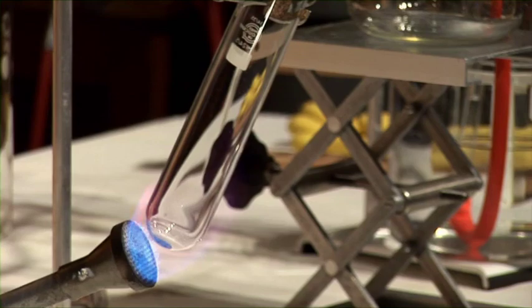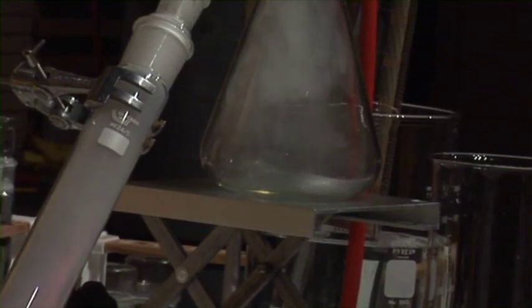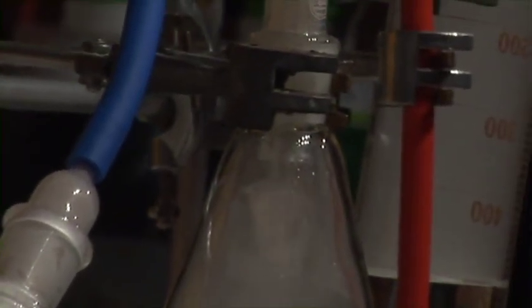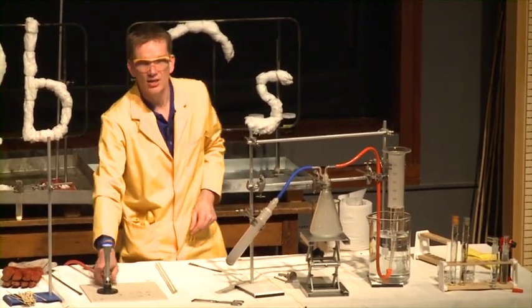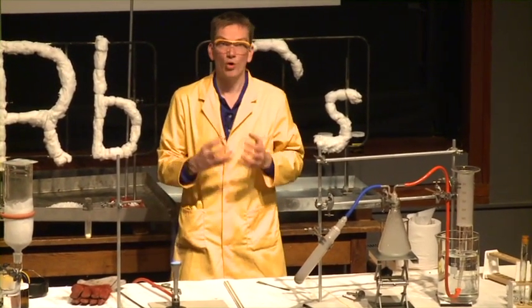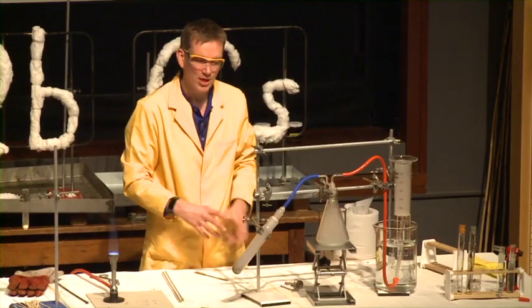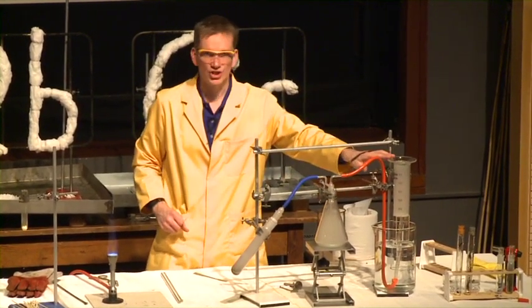Let's just keep on heating. And all of a sudden, look at the gas that's been formed. We're seeing a black colour forming in the tube here. The black colour is actually due to metallic sodium. And the gas forming over here is nitrogen gas. The sodium azide has decomposed to form sodium — that's the black colour — we've got metallic sodium, pure sodium. Maybe it's beginning to react with the glass. But we're also forming nitrogen gas.